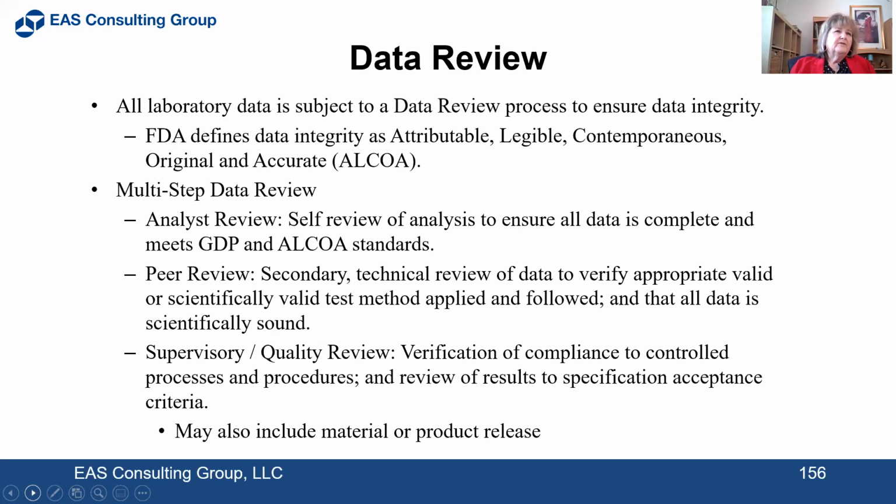You're going to have a peer review, a secondary technical review of data to verify appropriate, scientifically valid test method was applied and followed, and that all data is scientifically sound. And then last, you're going to have a supervisor or a quality review to verify compliance to controlled processes and procedures and review the results to specification acceptance criteria.